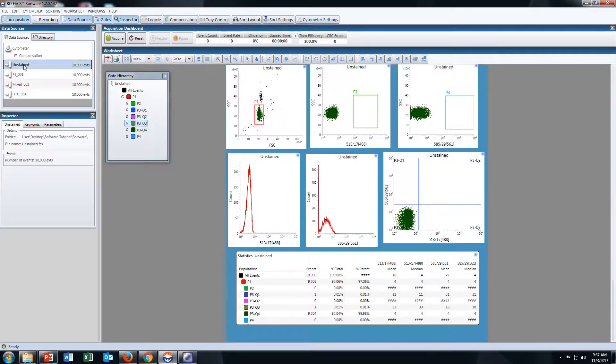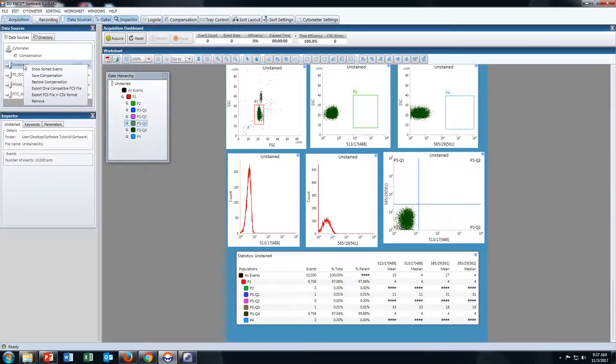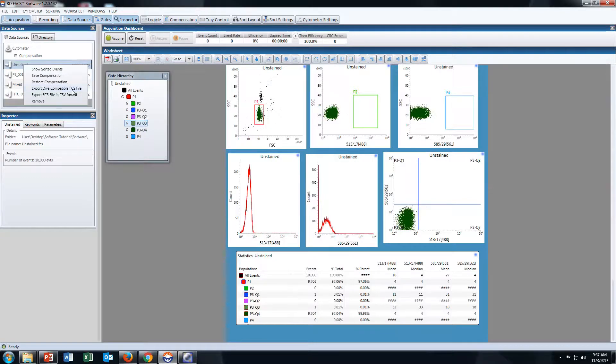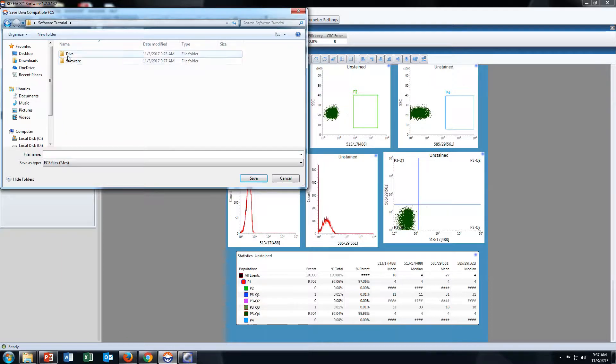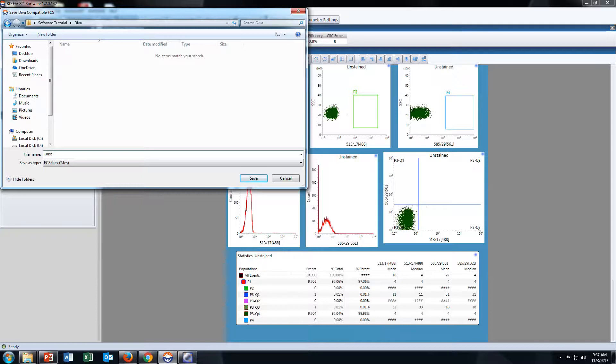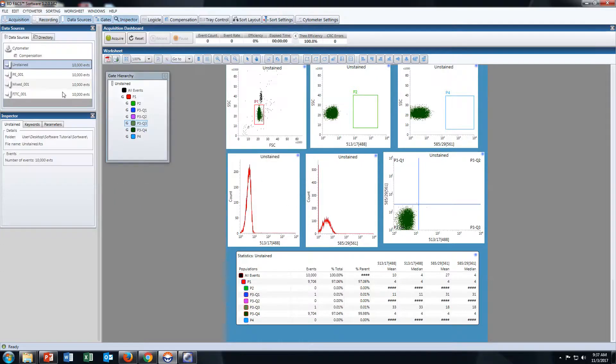First, click on Unstained, right-click, and export DIVA compatible FCS file. Save it in your folder. The first one is Unstained. Click Save.